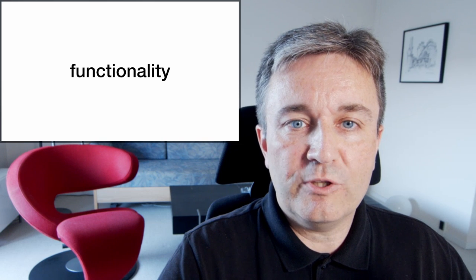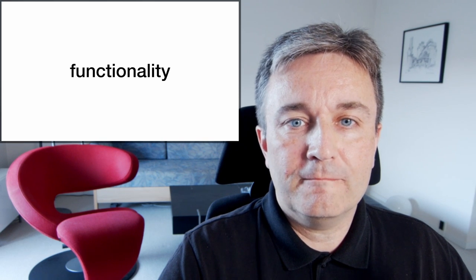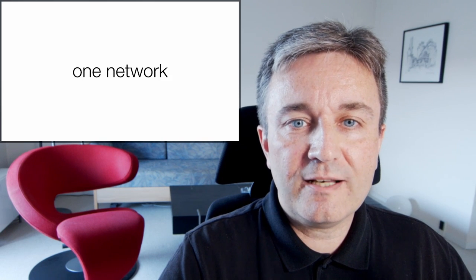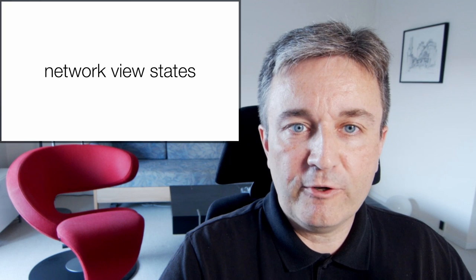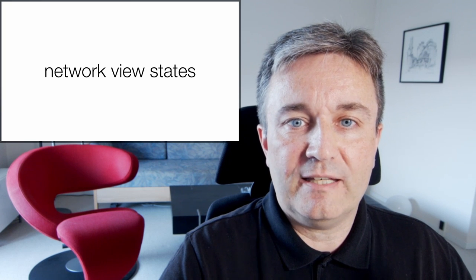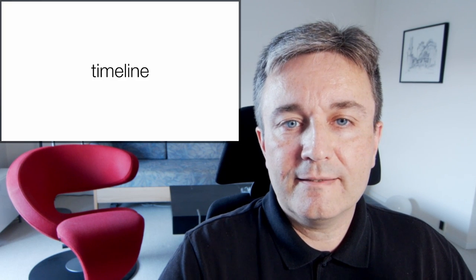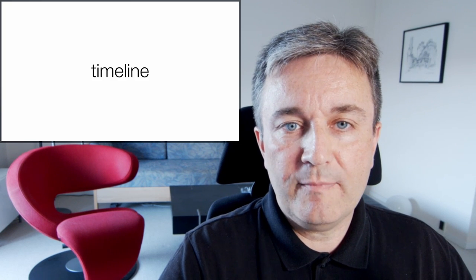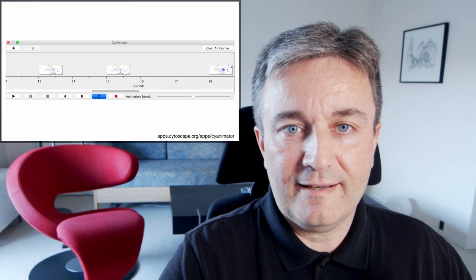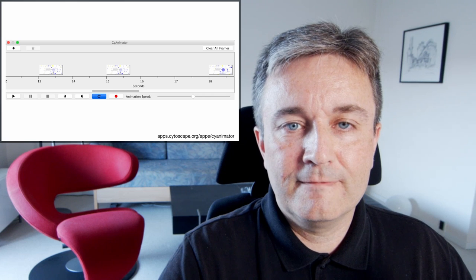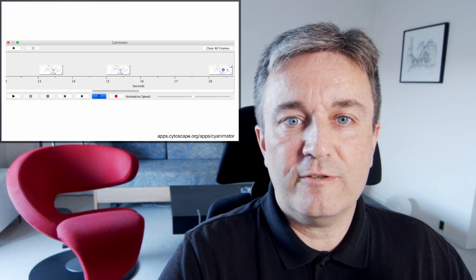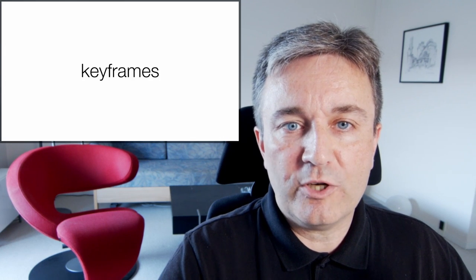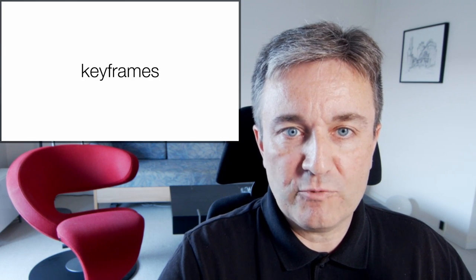Let's start with the functionality. The fundamental idea is that you have one network, but multiple different view states of that network. These are put on a timeline looking like this. The different views or states of your network is what is called keyframes.